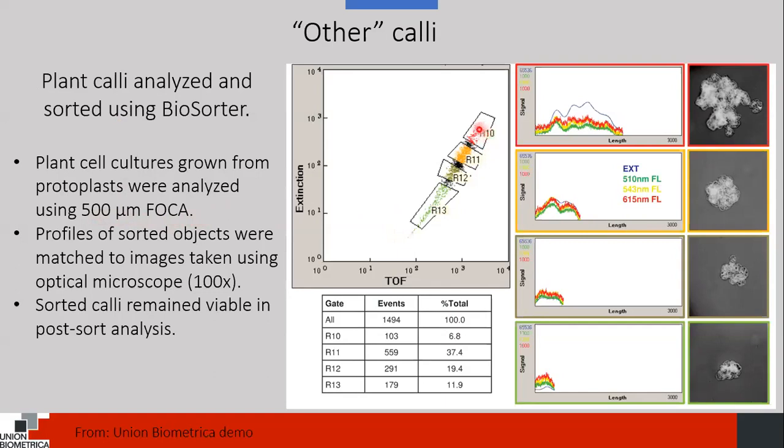where all of them sort of could pass through the foci. And we ran some, then arbitrarily selected regions that were high extinction and big, and some that were smaller still, and the smallest group. Sorted these out one per well, so that we had one per well and the profile that corresponded to the object that got sorted. And then the researcher collected images for us.